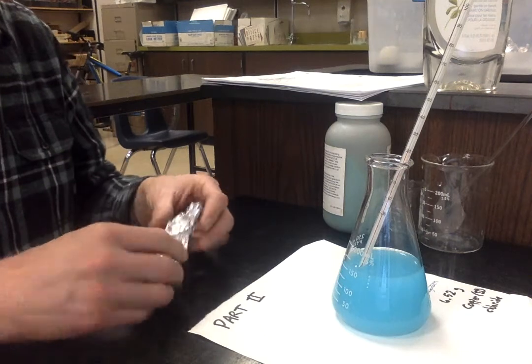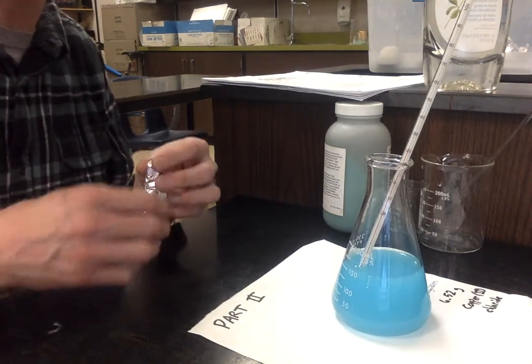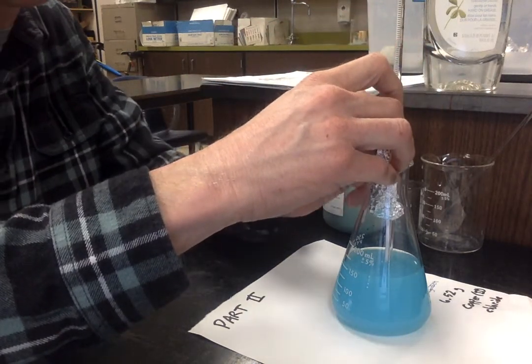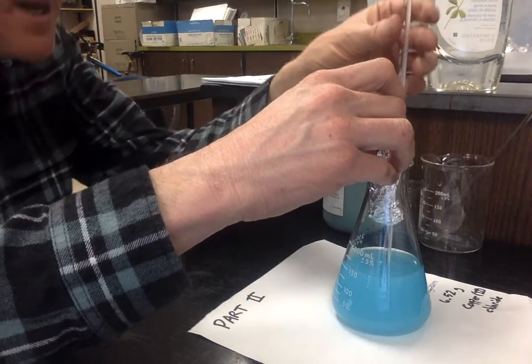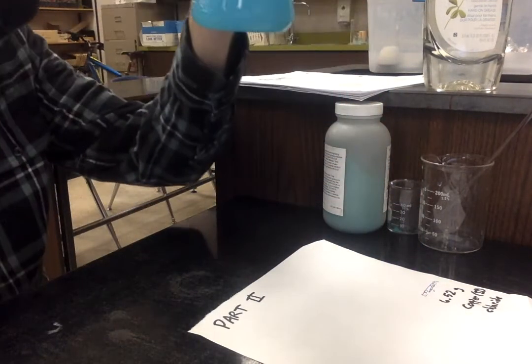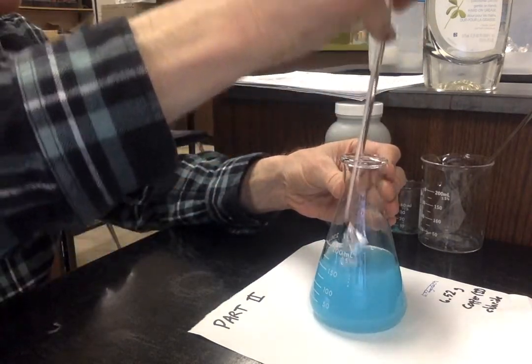I'm going to add a measured amount of aluminum, 0.75 grams. Here we go. Remember to record the color beforehand, and our temperature at the start is 21.5 degrees Celsius.